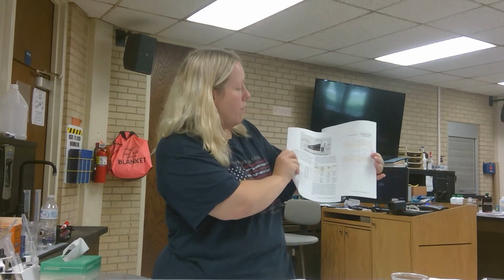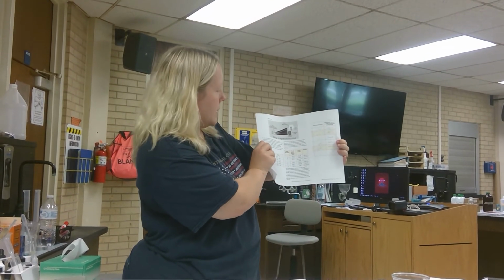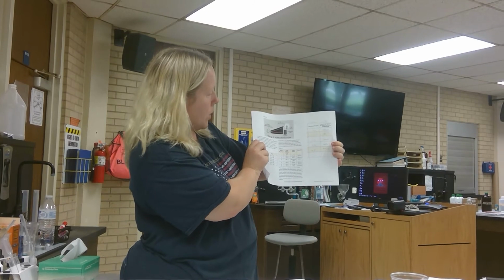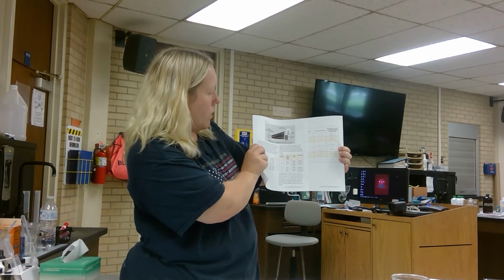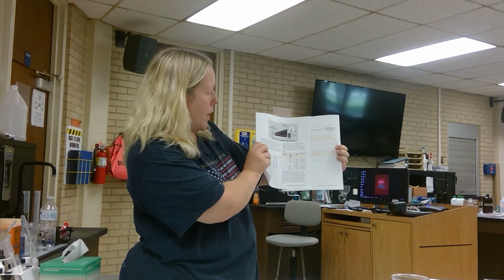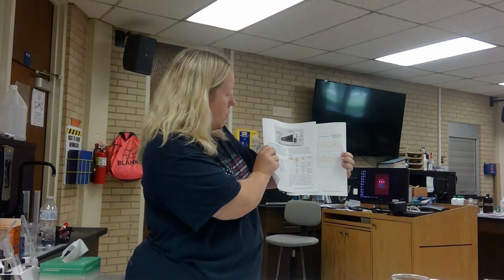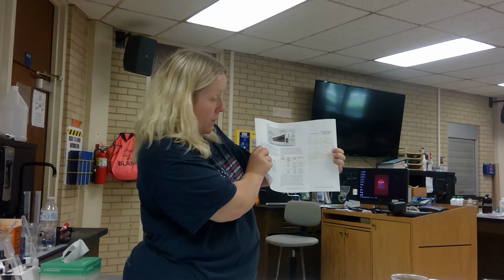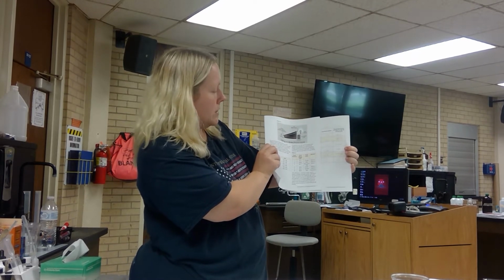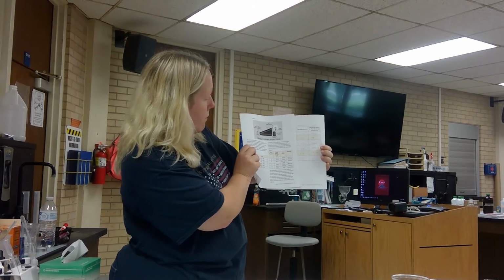So 4.4, that was a purple color, so I assigned that wavelength to be 405.4. 4.9, if that was my blue color, then I would write 436.6. Turquoise had a line scale number of 5.4 according to that spectrum that I saw, but that corresponds to a wavelength of 487.7.